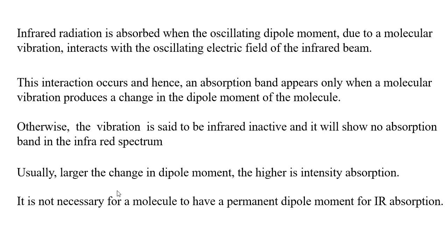See, it is not necessary for a molecule to have a permanent dipole moment for IR absorption, but the molecular vibration should lead to a dipole moment change. That is the minimum condition for IR absorption. Usually, the larger the change in dipole moment, the higher is the intensity of absorption.